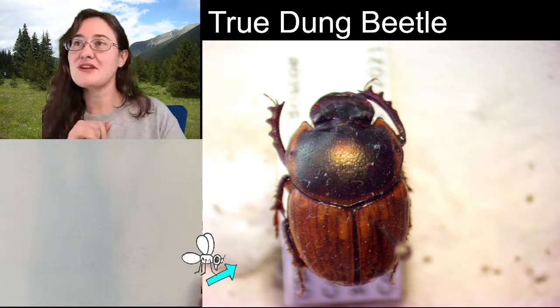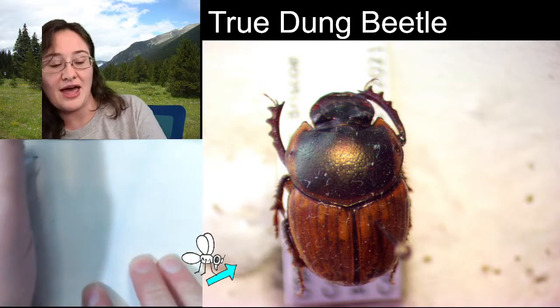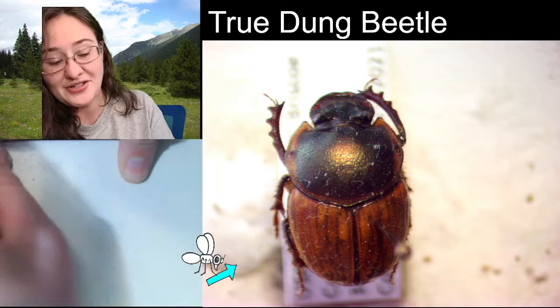So I'm going to leave it at true dung beetle. That's going to be subfamily Scarabaeinae. So I'm going to go ahead and write that on my paper. Derp. Dung beetle. I started writing scarab.